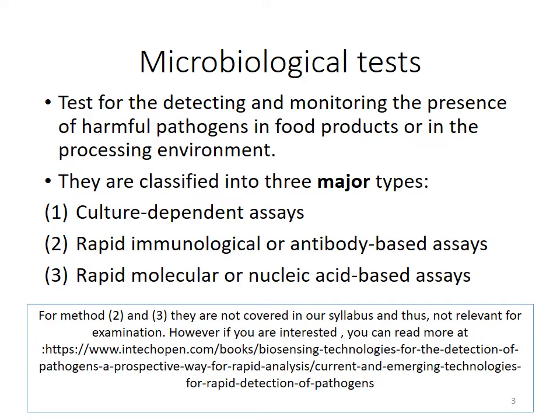Maksudnya, you can also conduct microbiological tests on surfaces, whether they are clean or not, and on the operator's hands, whether their hands are clean or not. So you can do microbiological tests to detect the presence of pathogens.